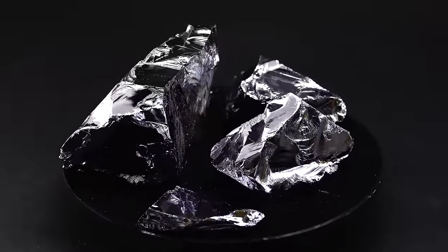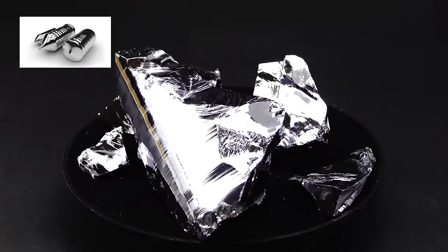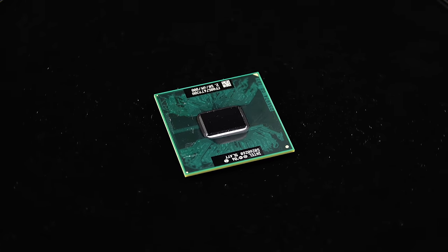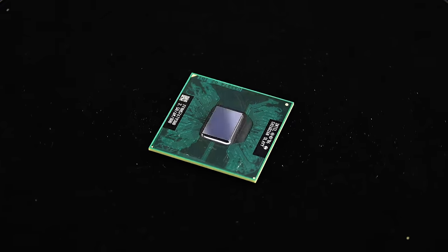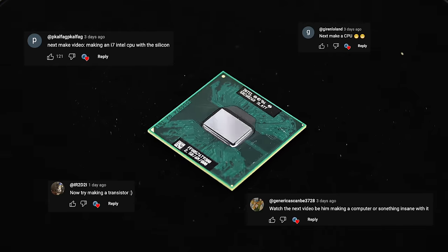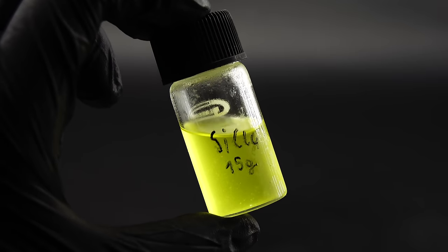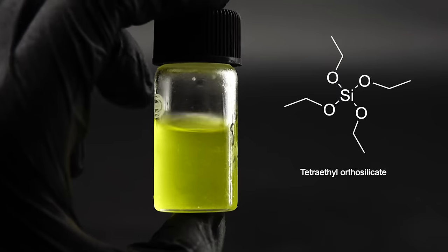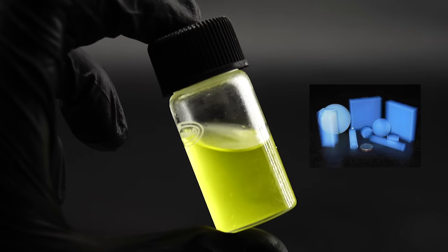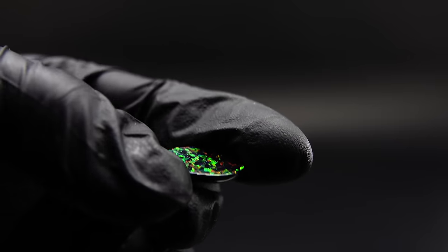It's then refined into these big crystal logs to use directly in the manufacture of integrated circuits such as this old laptop processor here and it's actually really interesting to think that today I will be one step closer to making a CPU from dirt, which is what a lot of people apparently want me to do. Instead of a CPU, however, I will convert my silicon tetrachloride into something called tetraethyl orthosilicate or TEOS, which is an incredibly useful precursor to things like aerogel and artificial opals which are the target of this whole gigantic project.